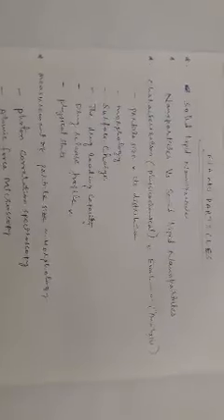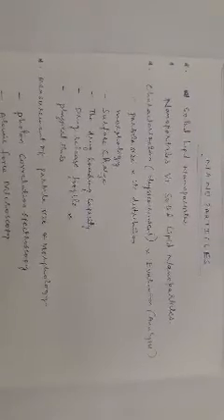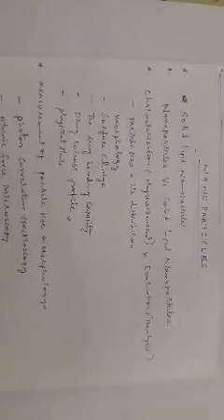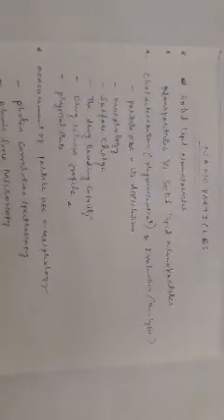Zeta sizer measurements of nanoparticles, size distribution, dispersion properties, stability, and propensity to aggregate are crucial to the design of both nanoparticles as well as new nanomaterials.